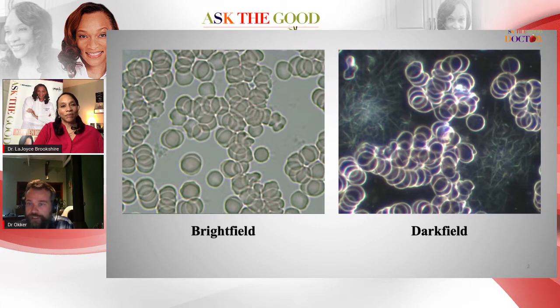Looking at those rings that are visible there in the dark field image, those are the red blood cells. And in normal conditions, the red blood cells should ideally be lying next to each other on one plane. They have a negative electrical charge on the surface of the red blood cell membranes called the zeta potential. Just like two same sides of a magnet, if you bring them together, they don't make contact. They naturally repel each other. This is the same concept that applies with the red blood cells. If the zeta potential is intact, the cells won't stick together.